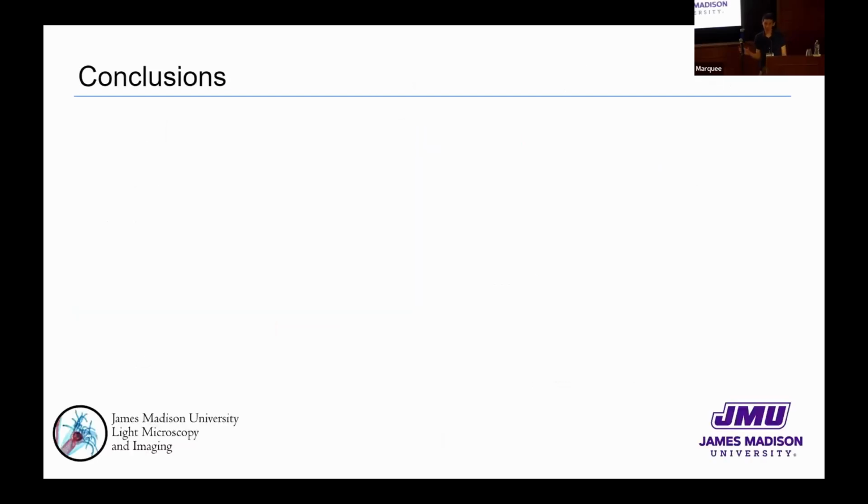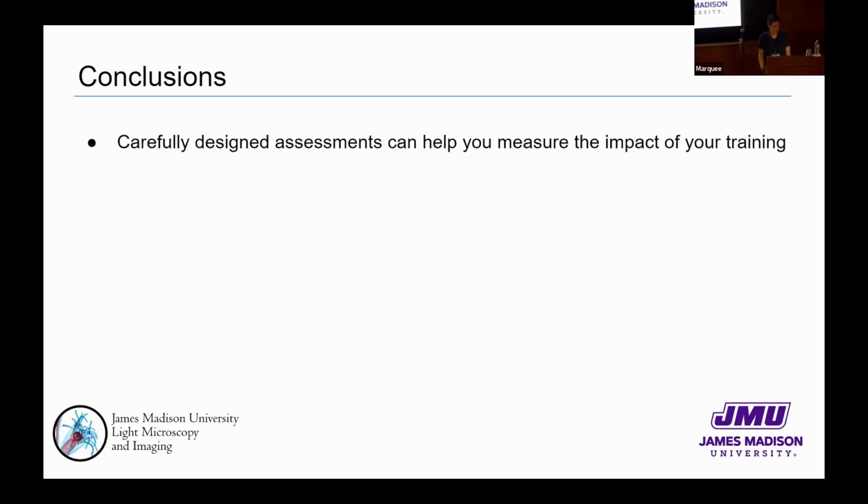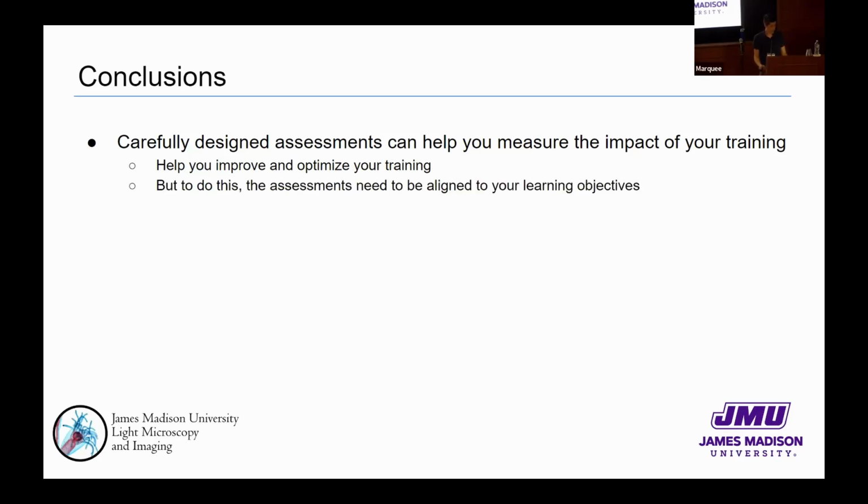Okay, so in conclusion, just to highlight a few things and review them, carefully designed assessments can help you measure the impact of your training. It can help you improve and optimize your training. Clearly we found deficiencies in ours, and we wouldn't have known it otherwise. But to do this, your assessments need to be aligned to your learning objectives, so those goals that Sylvie was talking about earlier.